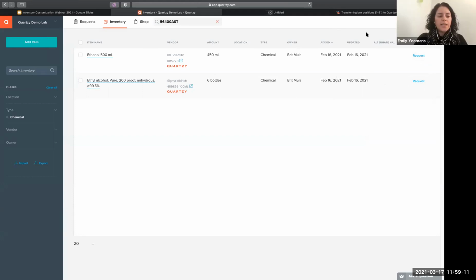So there's a question from Christina. I was just answering it in chat and I got cut off. So sorry, it's like a half sentence. It sounds like you were wondering about search and how you used to be able to just search a short term like B12 as opposed to vitamin B12 or using a hyphen. So we did actually make some pretty major improvements to our search that should make it easier to find items without having to use that hyphen. If that's still happening and there's specifics, definitely reach out to our support team because I believe that should have been resolved.